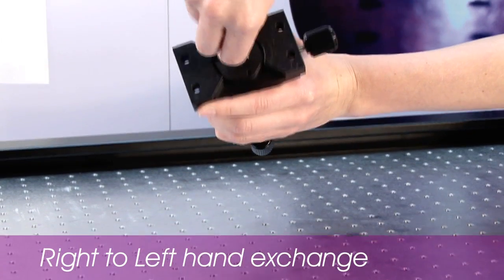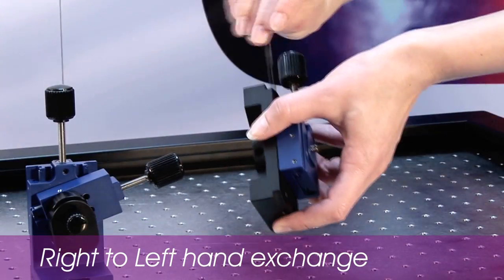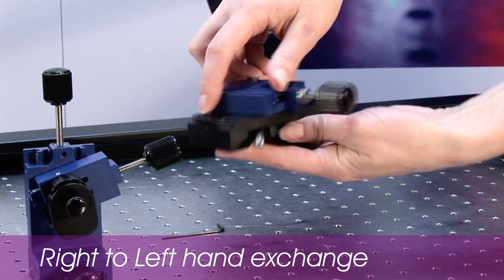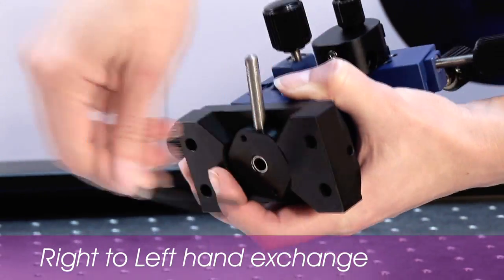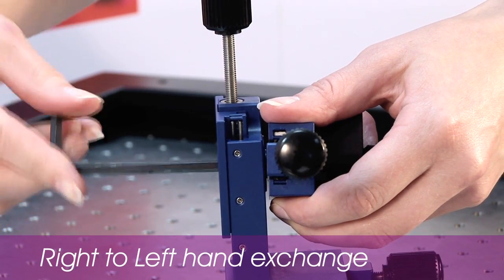The LBM7 can also be converted from right to left handed very easily using its modular system. A few simple rotations of the modules can allow the manipulator to be positioned either side of your microscope, increasing its usefulness on your rig.